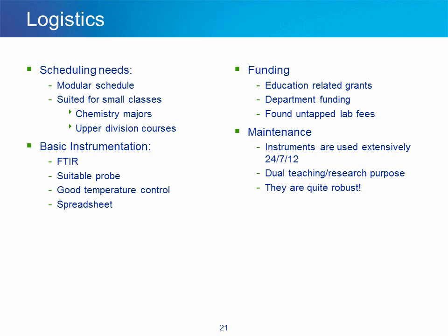One does not necessarily have to use the ReactIR and the EasyMax. In fact, any type of FTIR will work with a suitable probe, provided that probe is an attenuated total reflectance probe, a zinc selenide window that is stable to water and stable under basic conditions. You need to have good temperature control, so one does not necessarily have to use the EasyMax.